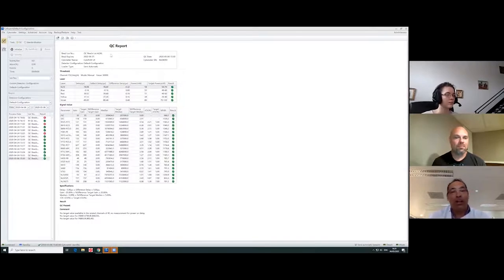You can see there that I have some red spots, and I want to see them. You, as a core manager, you want to see red spots. It would be nicer if I take them off and say, delete. I can do it, but I don't want them, and I don't allow my users to do it. I want to see if there's a problem to prevent any problems. If there's something wrong on that particular day, I can come back and say, look, there was something wrong here, and I can identify and reject those samples. Or these settings here, even if they fail, it's not affecting your sample. You're measuring in this laser, and the one failing is another one. So keep going. Okay?